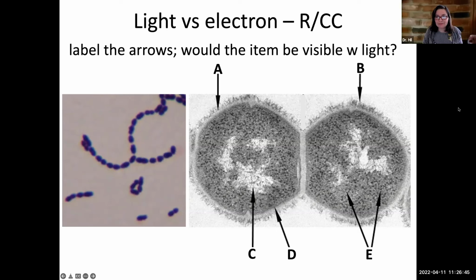B is, because this is a, so cilia is a good guess. Because this is a prokaryotic cell, as we'll talk about next week, they don't have cilia. Cilia are actually quite large structures. They do look like this if you were looking at the right magnification. But because this is a prokaryotic cell, we can be confident this is like fimbriae. Sometimes they're called pili, but they do kind of have a cilia-esque appearance under the right magnification. D here is pointing to the cell membrane.